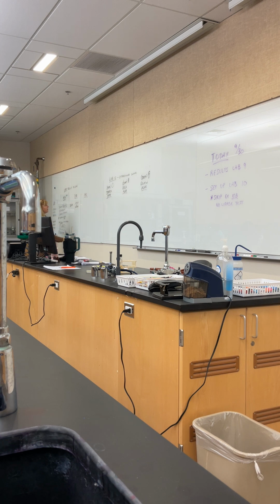Now, what we're going to be looking for with these sugar eaters then is who's able to eat both of these sugars, and who is able to eat a lot of these sugars. In other words, who makes a lot of enzymes. This media is looking for a special type of organism group called the coliforms. And we're going to learn a lot about coliforms in the future. Coliforms are just bacteria that live in the gut of mammals.